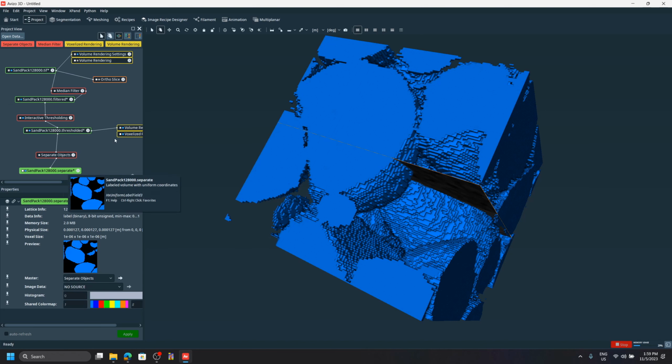All right, so it separates the particles, and at the same time, it does some measurements for you, like volume, surface area, and so on, okay? All right, so in this example, we actually did the whole pipeline, right? From looking at your data, segmenting it, and doing some simple analysis. And again, I just wanted to show you this, because this is kind of the main workflow.